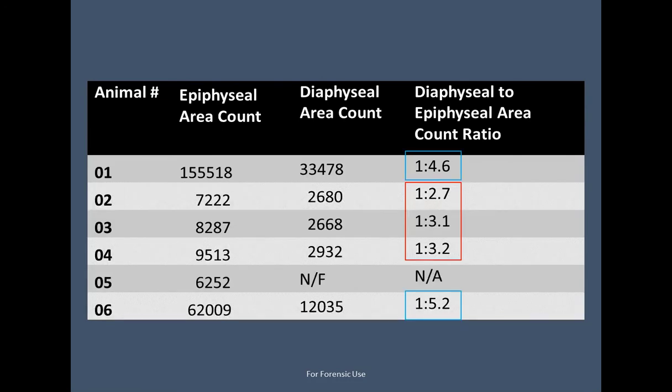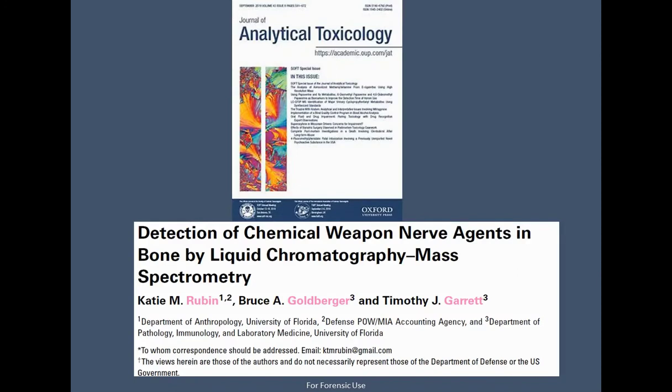And you can sort of see that as I click along, the blue versus the red. It tells us that ratio difference is really something that we're going to tease out and try to think about more ways in which we can use this information to help understand the biochemistry that's happening.